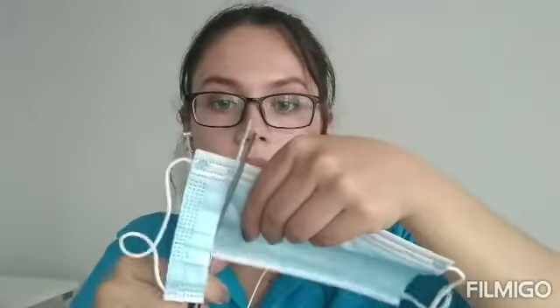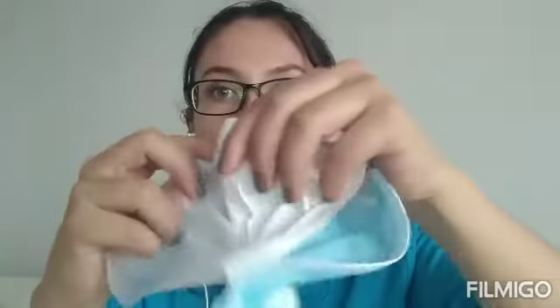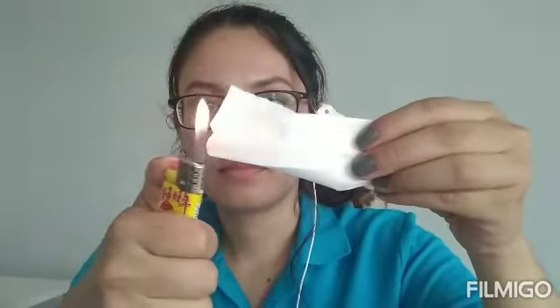So what we're going to do is take a mask and cut it, and remove the middle layer of the mask, which is the melt-blown cloth. Now we are going to burn the melt-blown cloth.